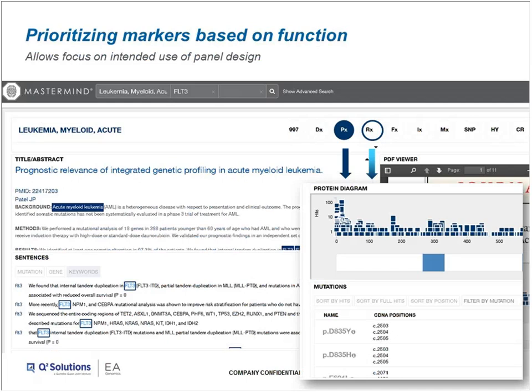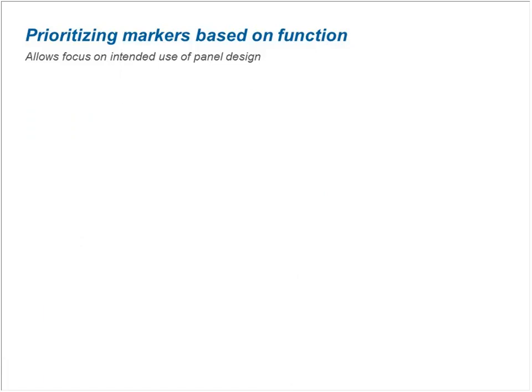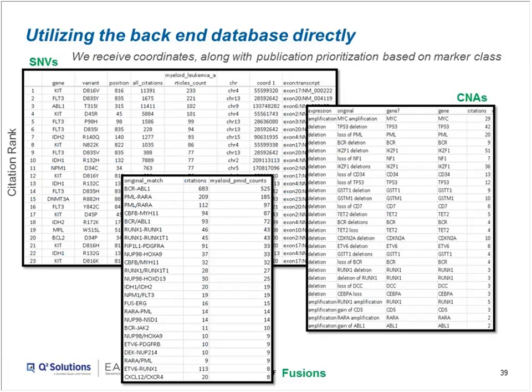the wide range of uses that a client might need. And I could start classifying, at least here by hand, markers and genes that are of interest. And that's great. So digging into the underlying database, how do I really start doing this kind of wholesale?